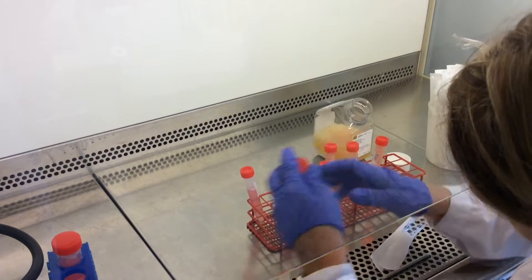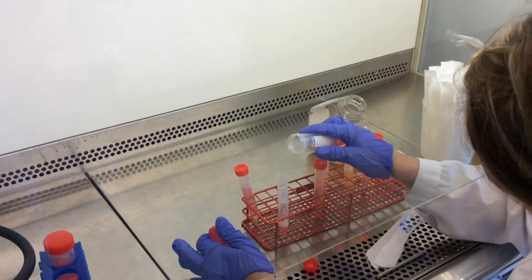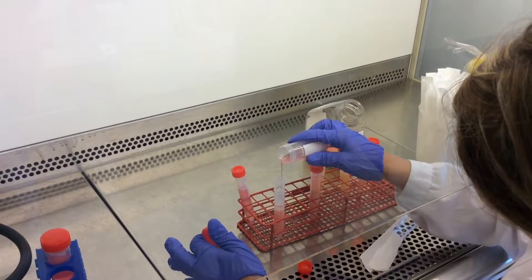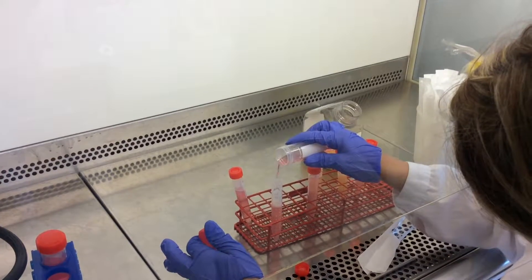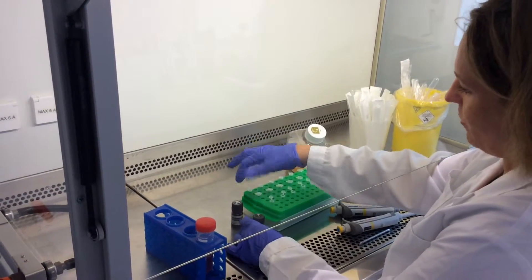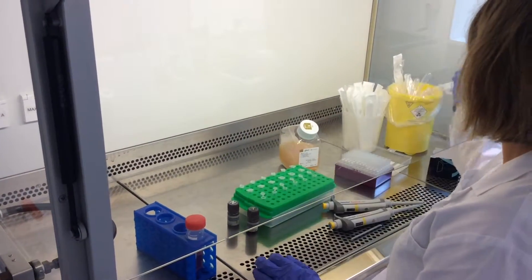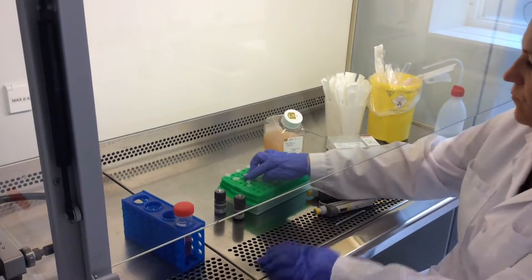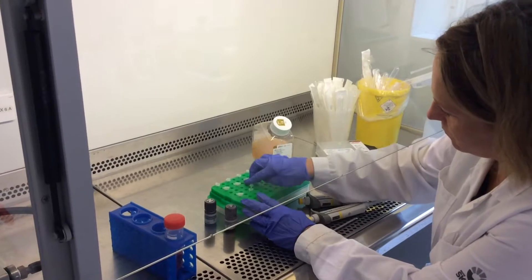She will now add fresh RPMI media to the cell suspension for one more wash. Magdalena is preparing the tubes for the counting of the PBMCs.